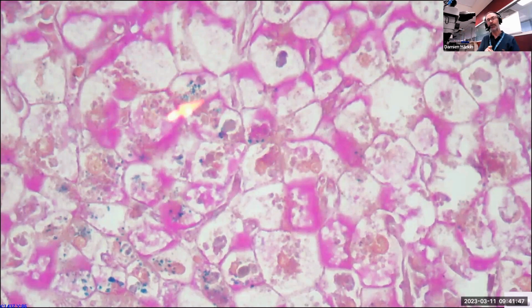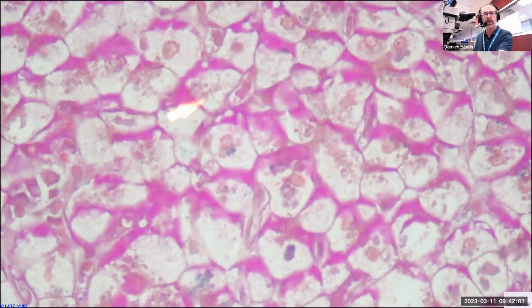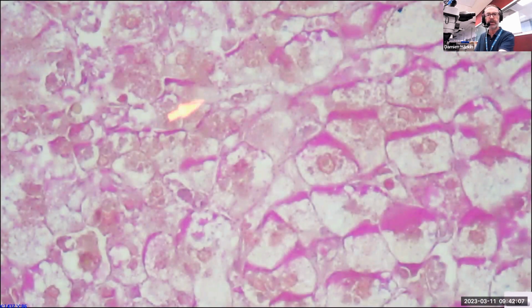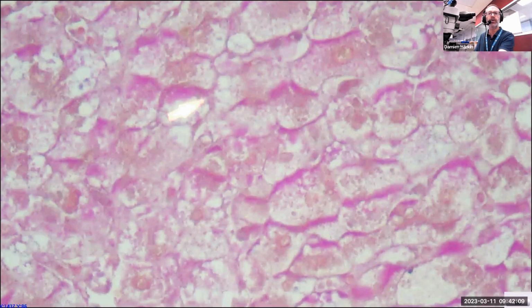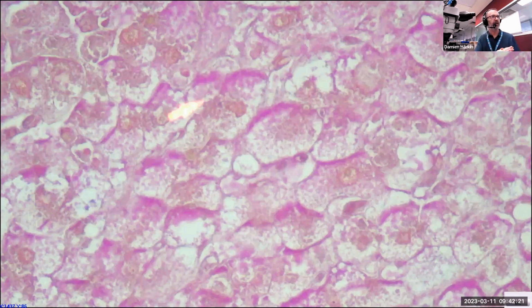So we've never done this before, but I told Chris that we're getting creative this week, and I reminded him of this lovely slide that he'd produced previously, and he's just gone off and, as usual, comes up with these lovely combinations. So what can we learn from this? Well, I think it demonstrates the type of outcome that you can obtain when you have mastery of these techniques, when you understand the histochemistry and what is likely to interfere with something else. You can actually combine these things in such a way that, it may just be for artistic pleasure, but it may actually provide you with more information.